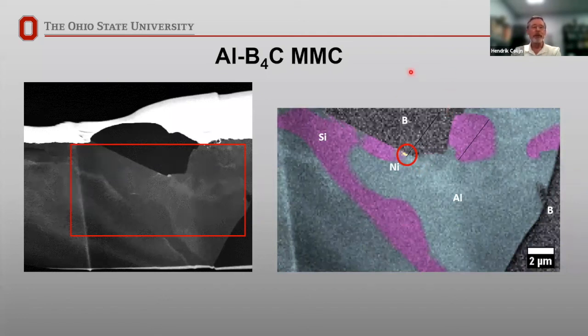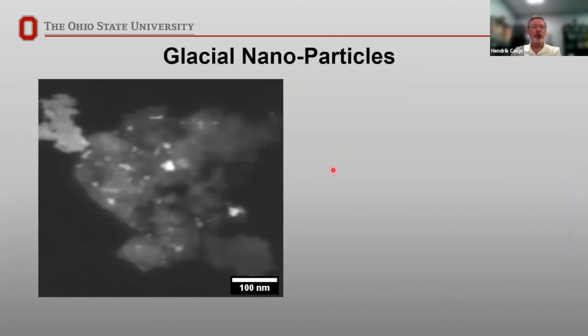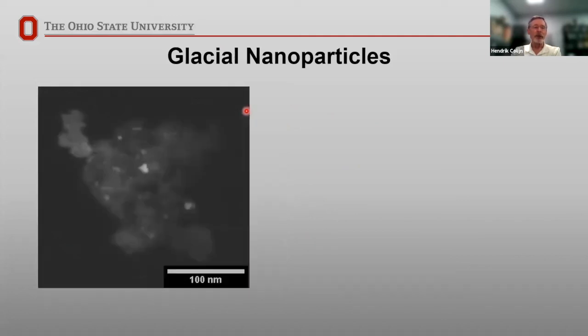Another example here that we've done in conjunction with the Byrd Polar Research Center, and this sample is from Paolo Gabrielli's research work. So this was a particle pulled out of a glacier in the Antarctic. And you can see that it's very heterogeneous, and we're down here in the few nanometer range. So we started looking at this and we did an EDX map of this particular particle.